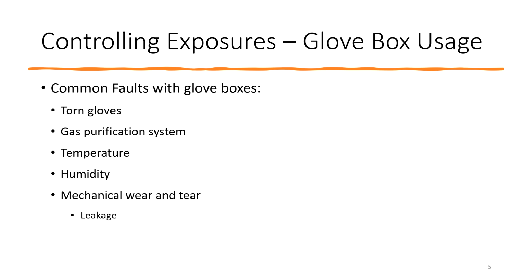The purification system then, if we're plumbing in nitrogen, argon, whatever we're doing in there, there's still a lot of human factors as part of this too. One of the big human factors that I see often is that people will have a cylinder of nitrogen, and when they go to use the glove box, they forget to turn on the cylinder of nitrogen.